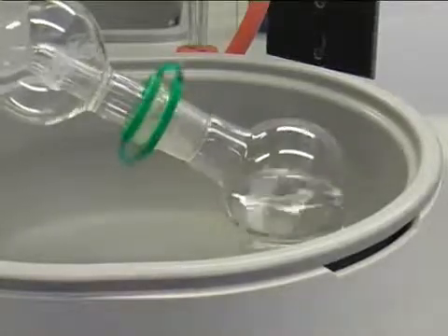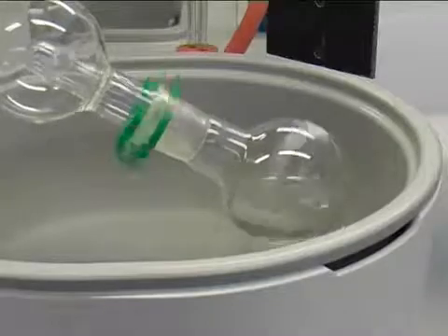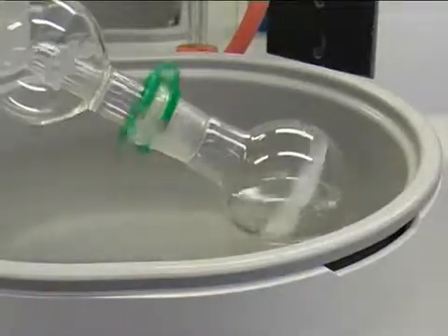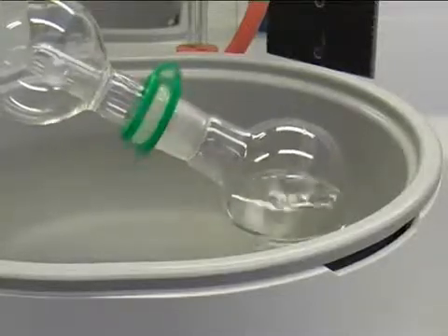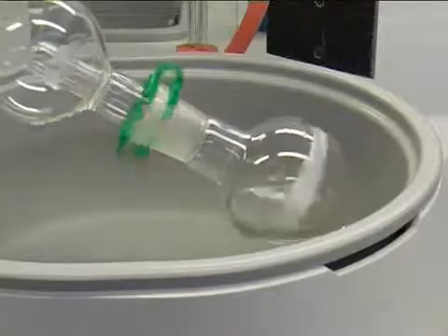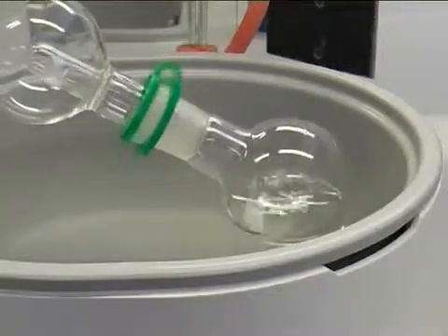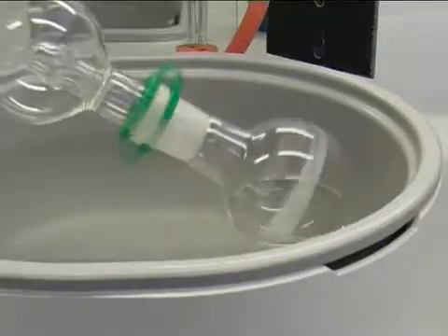As you can see here, after we have taken down the rotating round bottom flask, the levels of the water bath and the level inside the round bottom flask are roughly at the same height. The evaporation of the solvent will take some time. Finally, you will end up either with a glassy solid or an amorphous solid or maybe just an oily substance in your rotating round bottom flask.